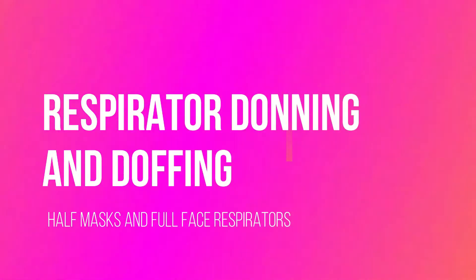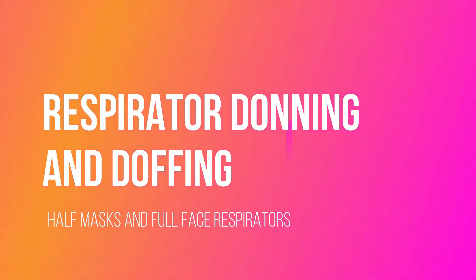Welcome to respirator training — donning and doffing for half-masks and full-face respirators. First, let's talk about a half-mask elastomeric respirator.